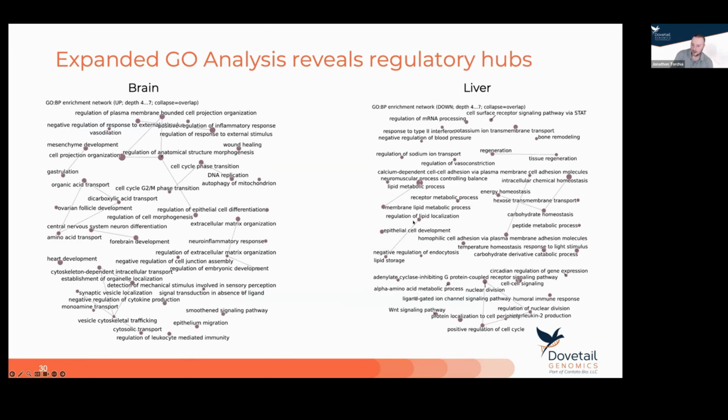Membrane lipid localization. I'm not going to claim that I'm an expert in any of these individual tissues, but at least from the bird's eye view, to the untrained eye, we're able to really easily and simply boil down our results into the results that we think are the most important for your samples.